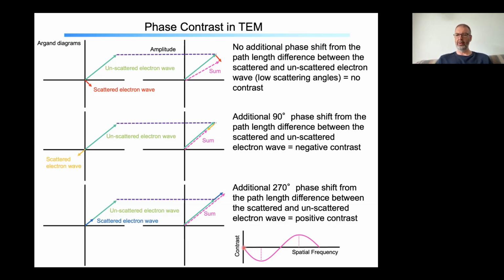And then this starts to look like the standard contrast transfer functions that we see from the microscope, where we start with negative contrast as the scattering angle increases. As you go up to higher spatial frequencies, you get maximum negative contrast. So this spatial frequency is represented fully, and then you go back to where there is no transfer at this spatial frequency, and then again it flips, so you now have maximum positive contrast and maximum transfer of this spatial frequency, and again going down to 0.